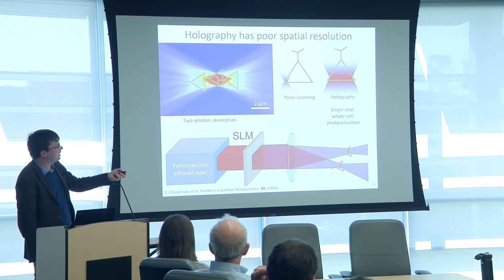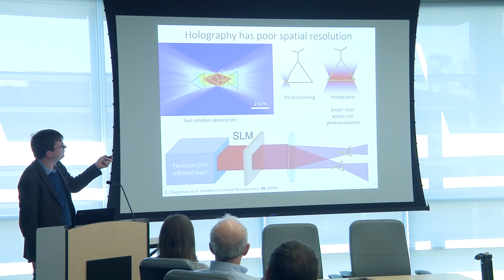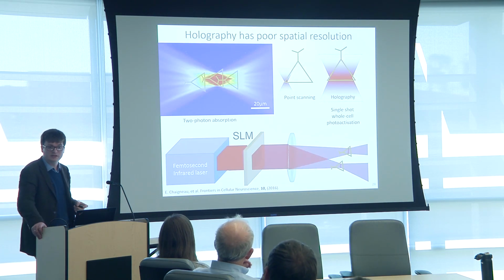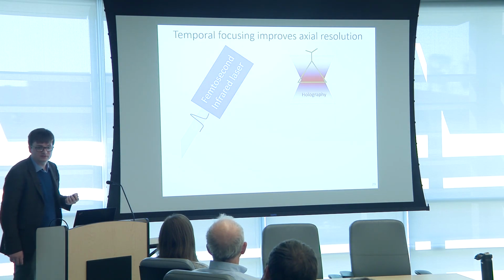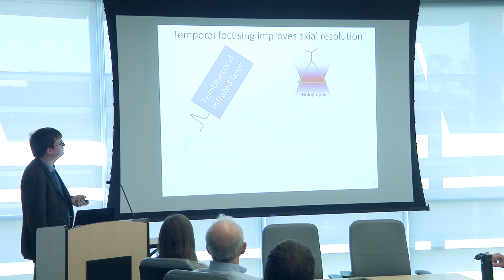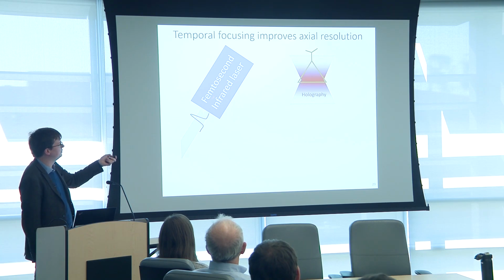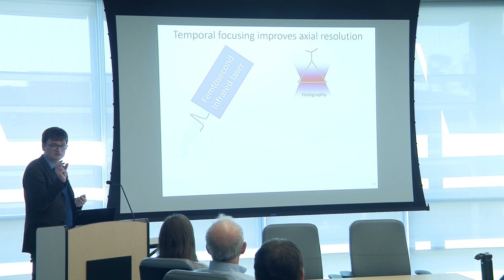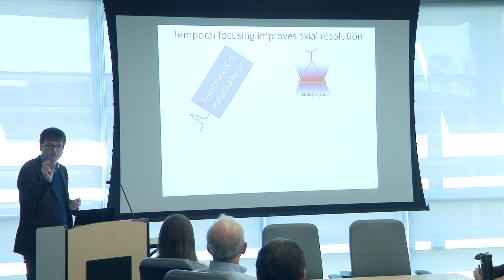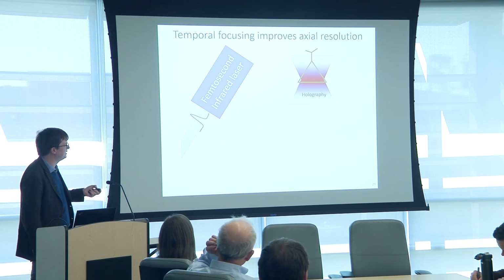So now you have very precise temporal resolution, but you do not have the single neuron resolution you were really attached to. So temporal focusing addresses this type of problem. So how do we make temporal focusing possible? Well, you take your femtosecond laser, and as we said before, the pulses are very narrow in time, therefore they contain multiple colors. Their bandwidth is really wide. I mean, a couple nanometers, but wide enough.